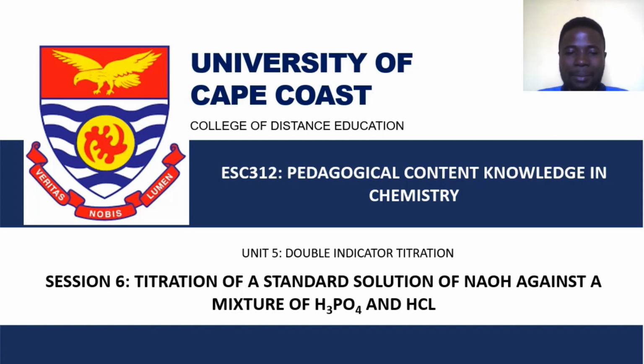The session is about titration of a standard solution of sodium hydroxide against a mixture of phosphoric acid and hydrochloric acid. Here we are going to use the discontinuous method to determine the concentrations of phosphoric acid and hydrochloric acid in a mixture. Let's look at the objective for the session.